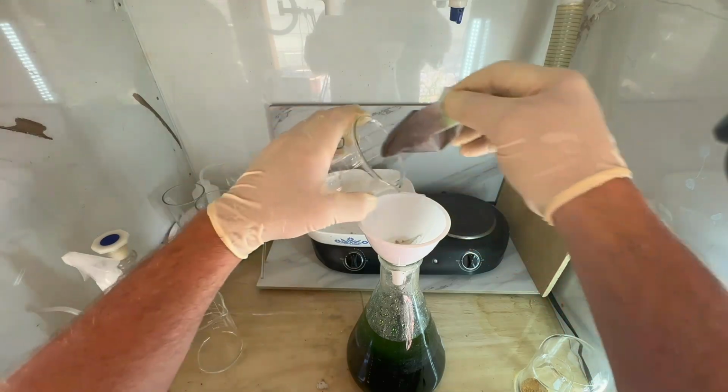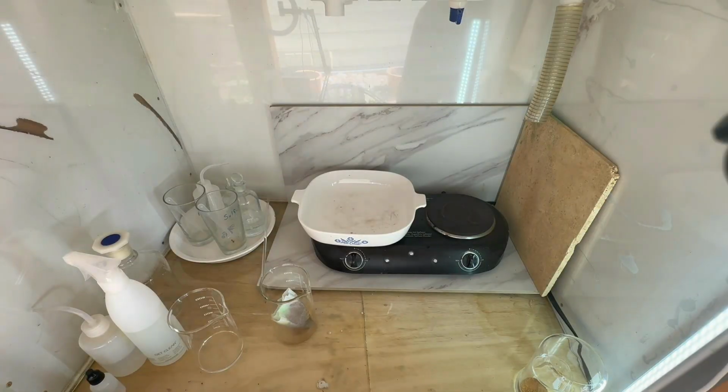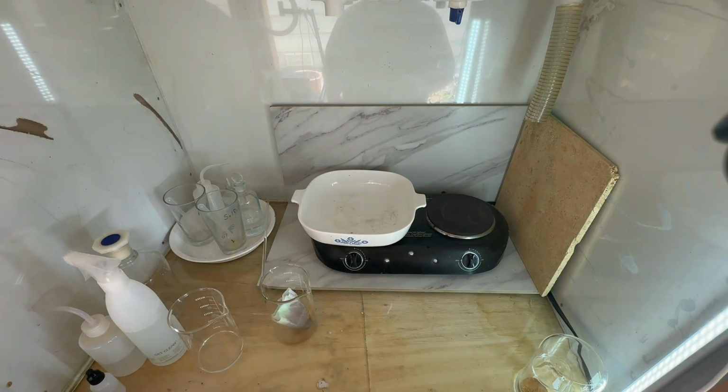Okay, going to take our filter here, put it into the beaker. We'll move our waste solution this time. I think it really is waste solution off to the side. We're going to dissolve this in aqua regia.